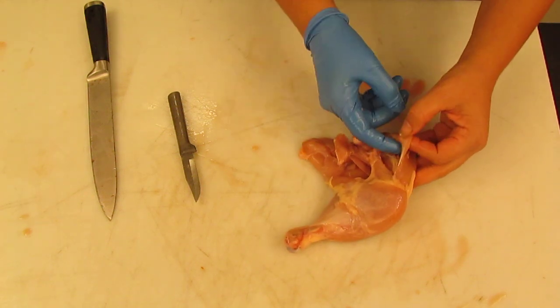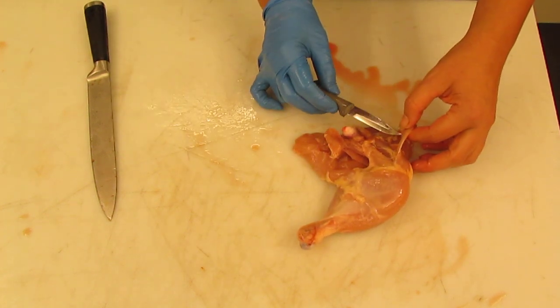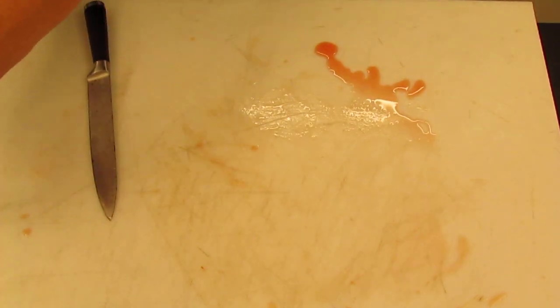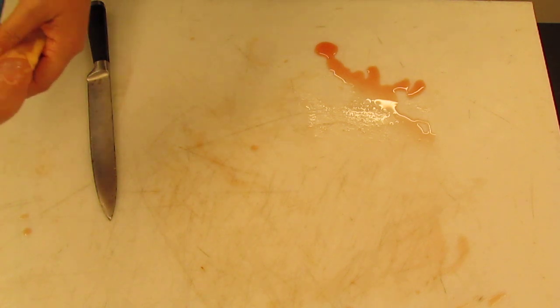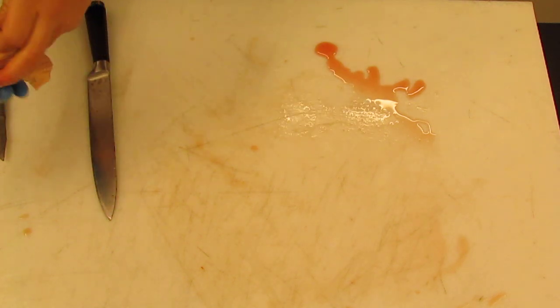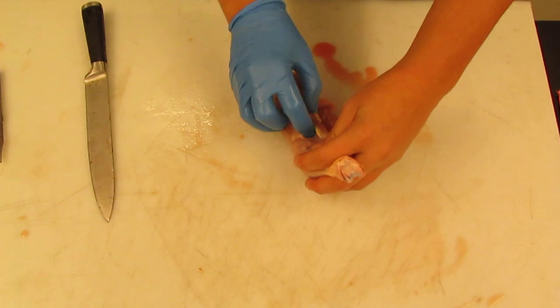Okay, first, if we look towards the end of the muscles, we see that it gets a little bit shiny. Okay, try to show you here. So I have a muscle in my fingers, and at the end of this muscle, it gets white and shiny. We can also see that down here. Right, so this shininess here is actually attaching the muscle to the underlying bone. And so we're going to call that a tendon. Okay, so any tendon you can identify is good for me. Okay. Again, any questions you have for me?